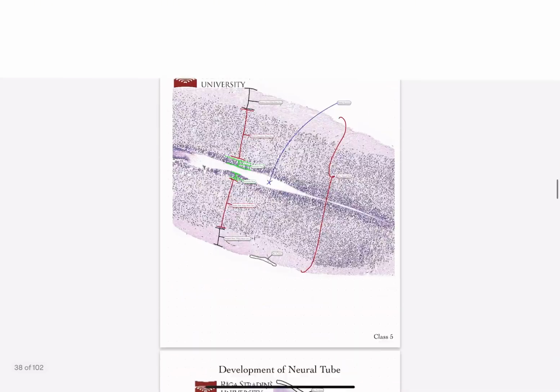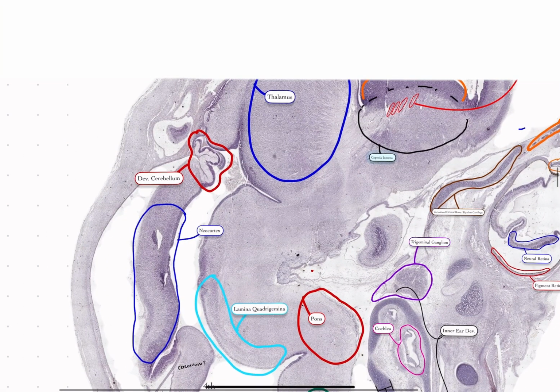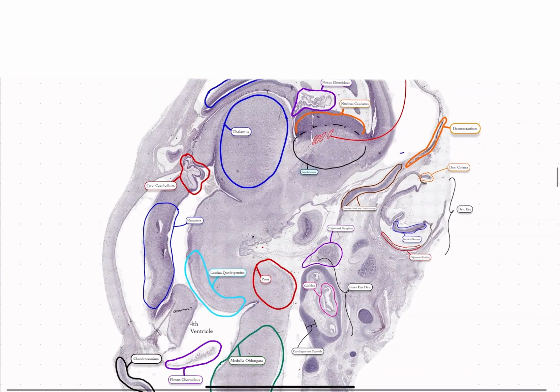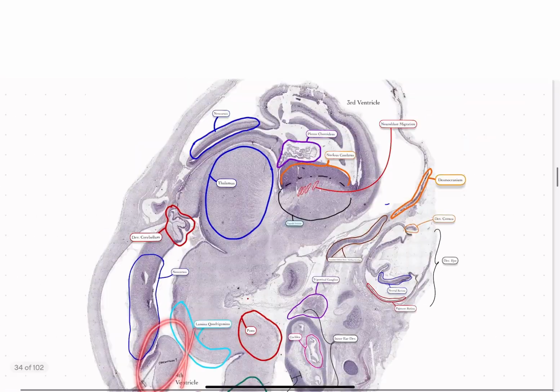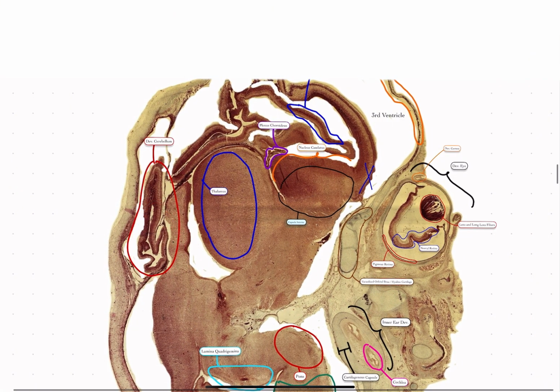But not all slides will show you the cerebellum that detailed. So that's why a lot of people might assume that this is the cerebellum or this instead of this. It again all depends on the professors. A lot of professors say different things. Double check it with your professor, make sure that you know where the cerebellum is, and make sure to ask if that is a prominent structure to remember for the colloquium.